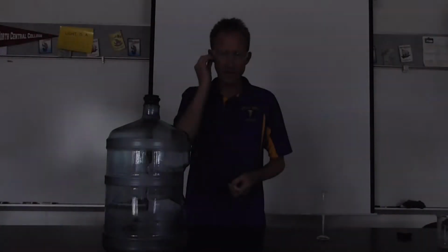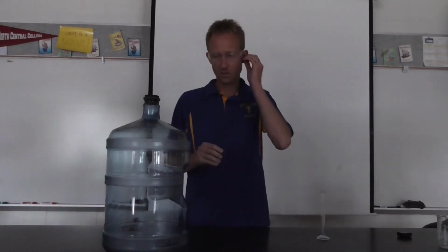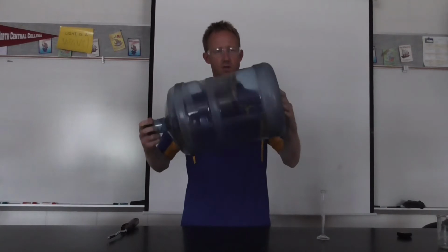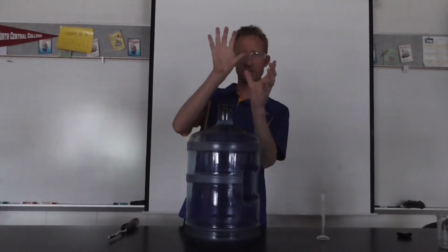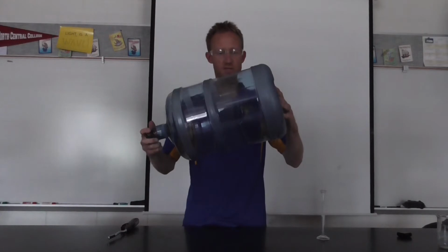And I'm going to be wearing earplugs for this because this might be a little bit loud. Hopefully it's a little loud. One year I was able to blow out that ceiling tile up there. It blew the ceiling tile out and torqued it to the side, and all semester we had a ceiling tile that was out of place.